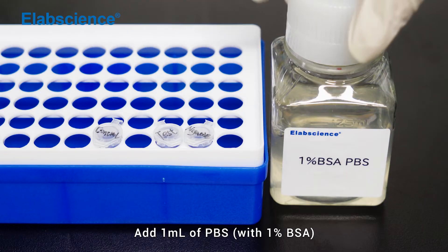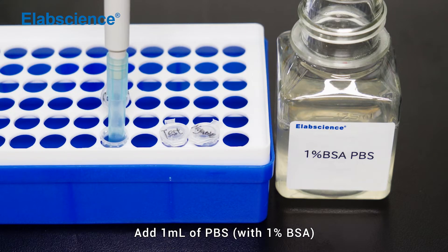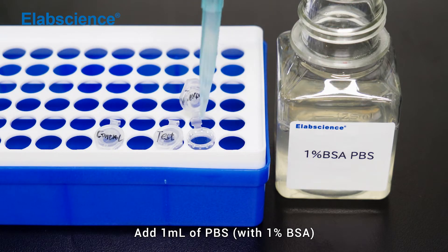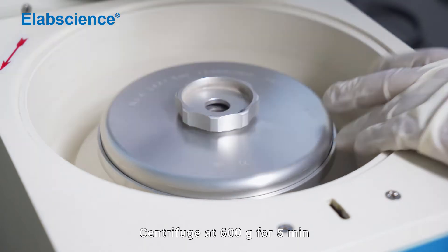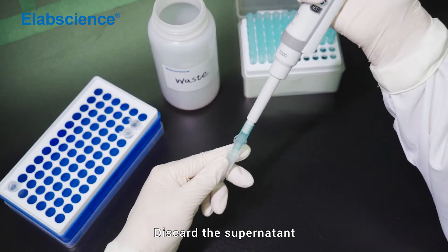Add PBS to wash the cells. Centrifuge at 600×g for 5 minutes. Discard the supernatant.